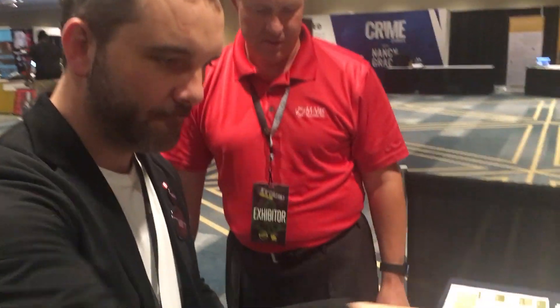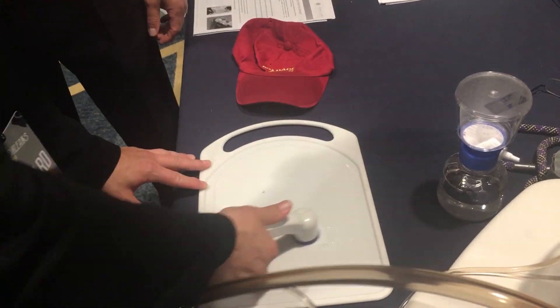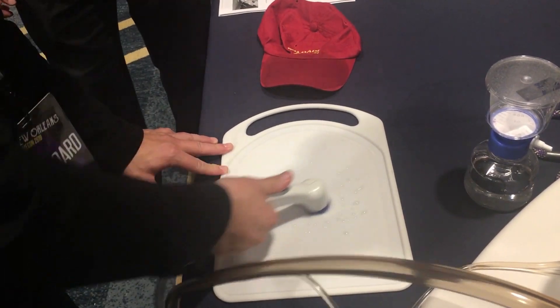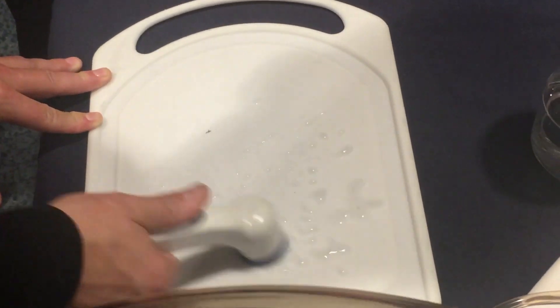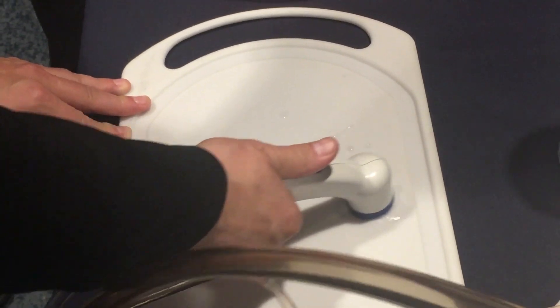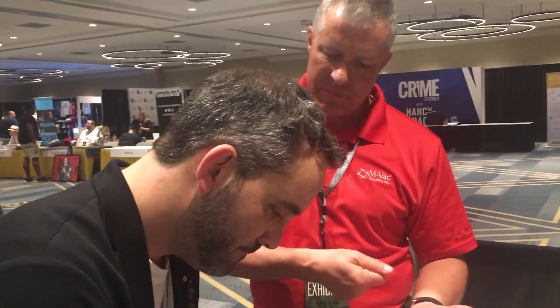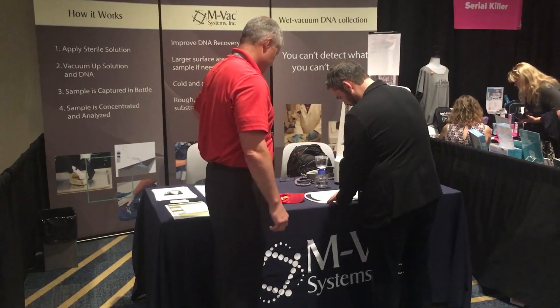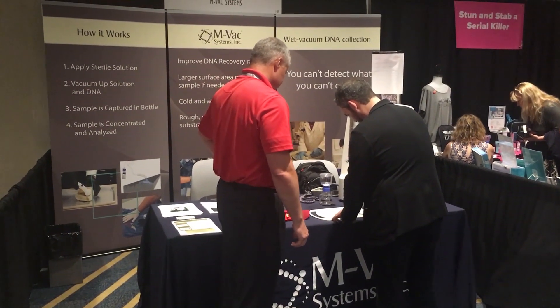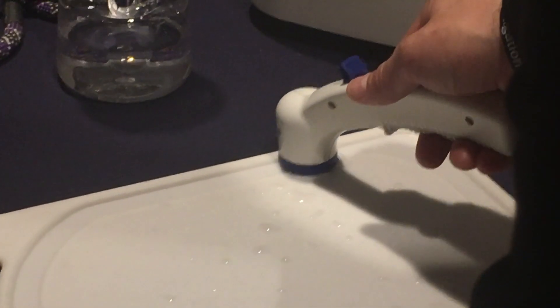Put your vacuum on. You want to allow the solution and the vacuum to do the work — it's not a scrubbing motion. You can just do it with two fingers; that's the best way to do it. Look at that — 30 seconds and you're done. Are you hiring?